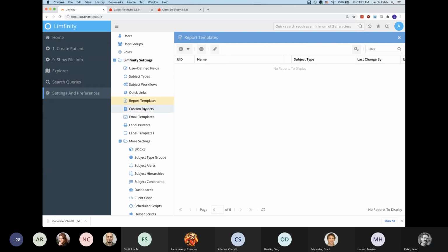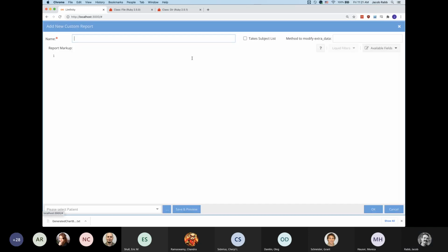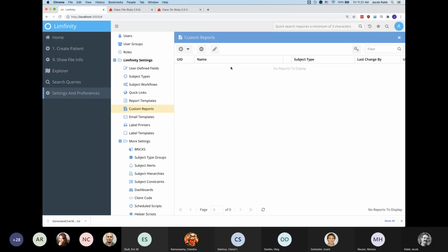So they were asking, is there any way that we can manipulate that, not the system one, if it's coming from a tool, in the before script or somewhere, to give an option to select the PDF. You mean a PDF that would contain something that looks like the General or Explorer report? Yes. So that could be done.